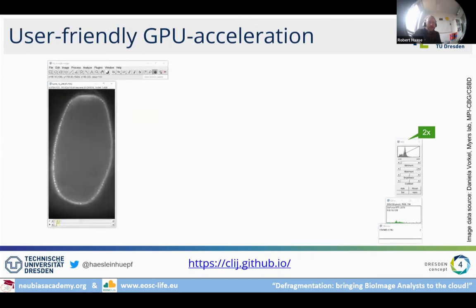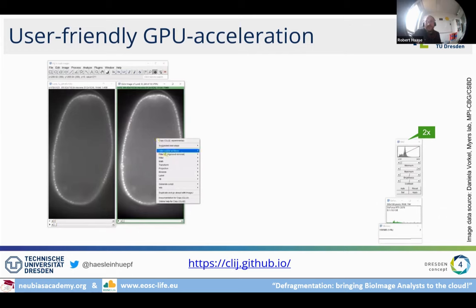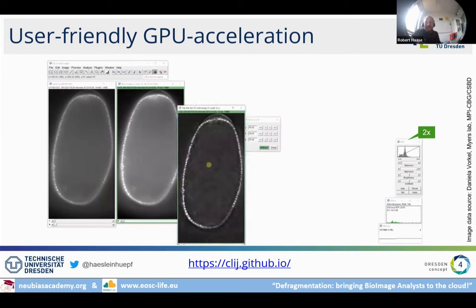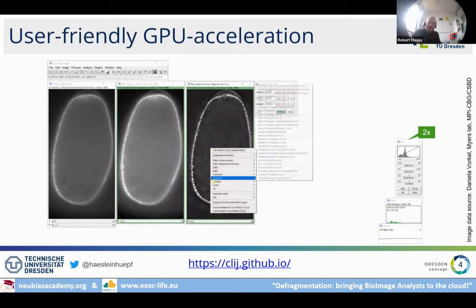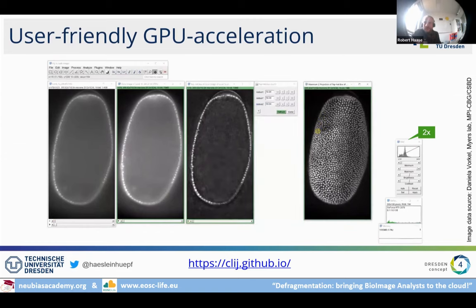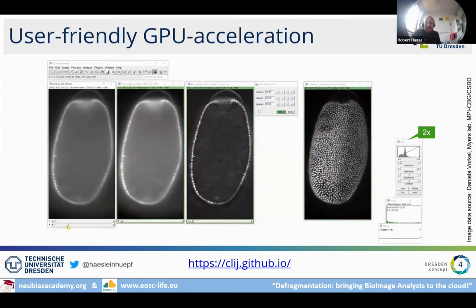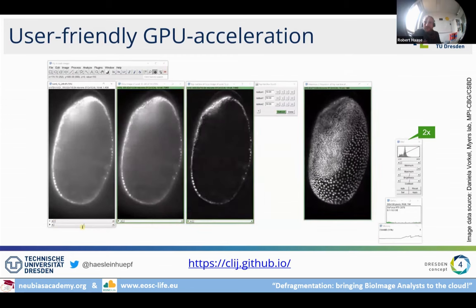That's why I wrapped it all into user-friendly Fiji plugins and Napari plugins. You can see here already the CLIJ assistant, where you can do the same operations but see results instantly. You can also process time-lapse data immediately, getting feedback if you have a powerful graphics card.